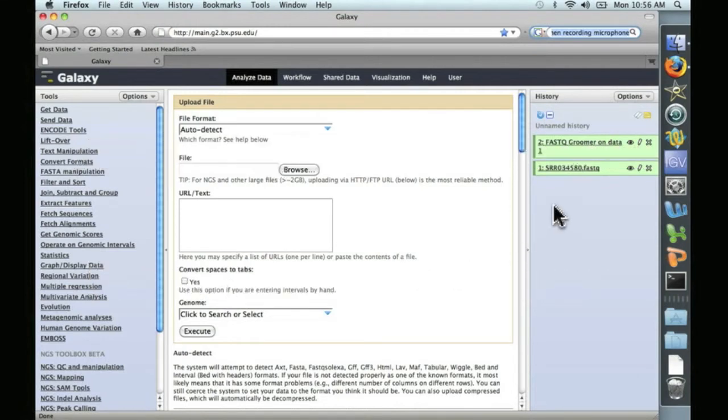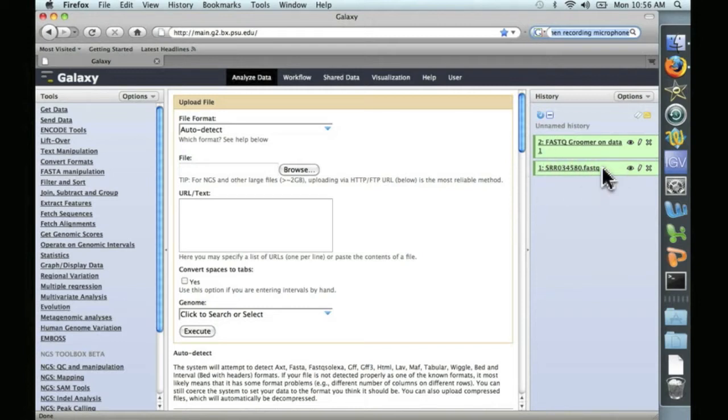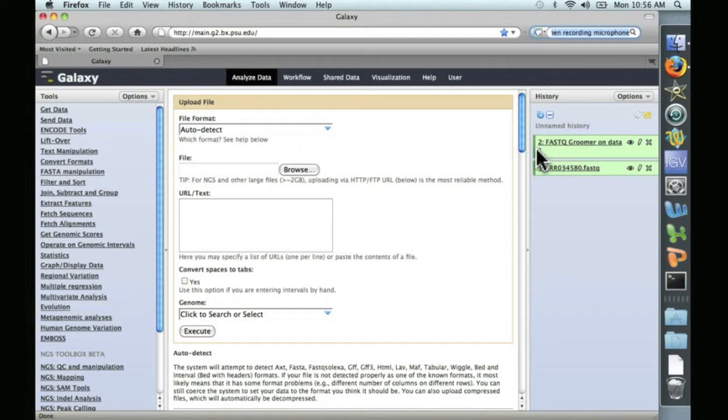In our last video, we uploaded a FASTQ file containing next-generation sequencing data from a RICE experiment, and then we groomed that data in the form that will be needed for the alignment.